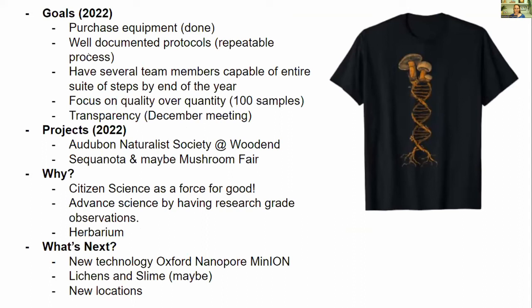We have some goals, some tenuous goals that we've set for the current year, 2022. First of all, we need to buy the equipment to get set up to do the DNA extraction and amplification. That's all been completed. Great thanks to Megan Romberg again on that. Because of all of her years of experience, we were able to achieve that in short order.